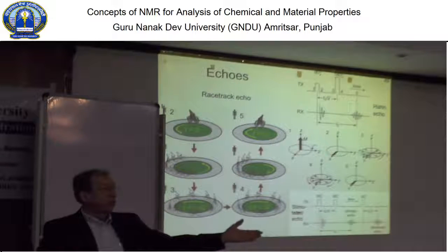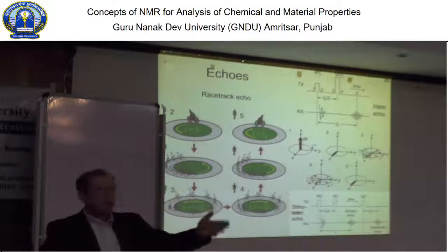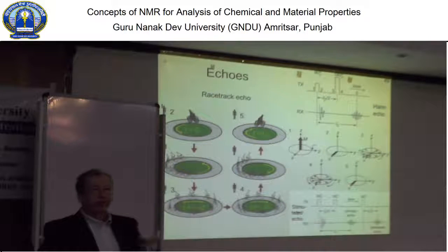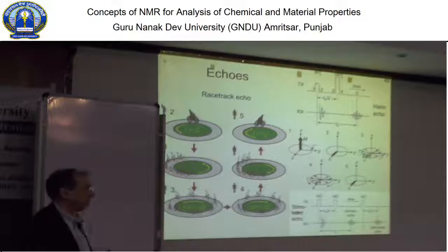In fact, that's something that the rubber industry uses when they produce car tires. They measure NMR to learn about the cross-link density locally in the car tire and optimize the vulcanization of the tire in the tire factory. At least in the R&D departments where they develop the procedures.